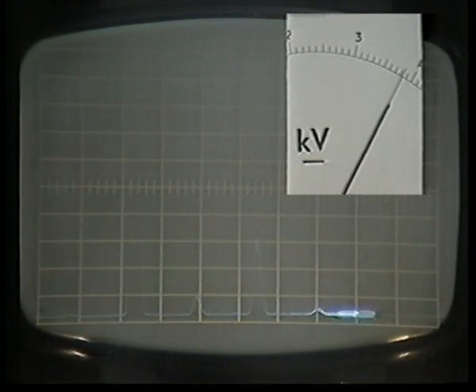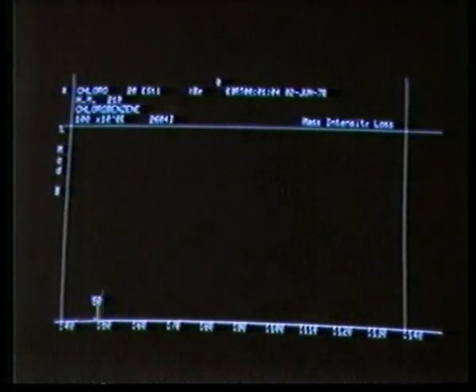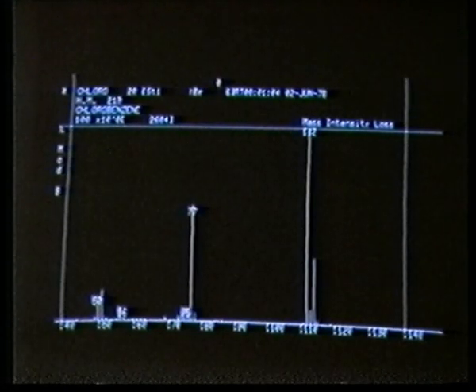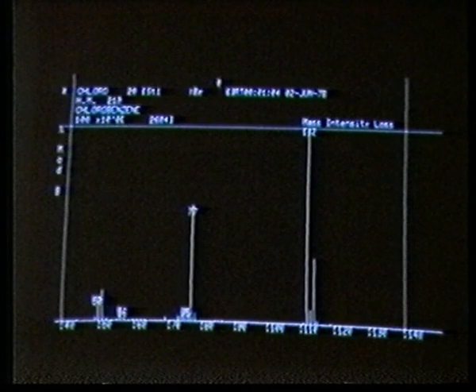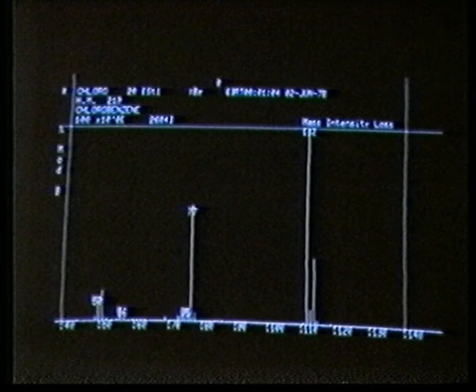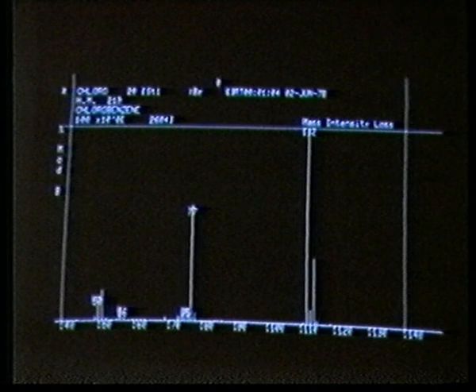The output can be further analyzed by computer enhancement methods. And this we can clearly see here. There are several peaks because of the numerous ions present. But once again, notice the two tall ones.